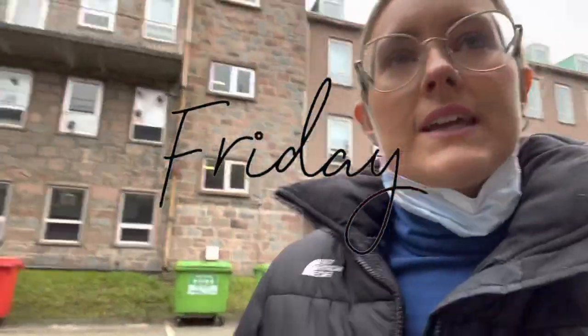Much better. Hi guys, it's Friday. I'm taking my plates to biological sciences so I can get the readings from the bioassay this week. However, they look terrible. I am really not convinced that my results are going to be good, and I know I shouldn't be sending out this negative energy before I even get the data, but I can tell from looking at the purple colors of the wells and the intensity of them that they don't look good, which is so annoying.